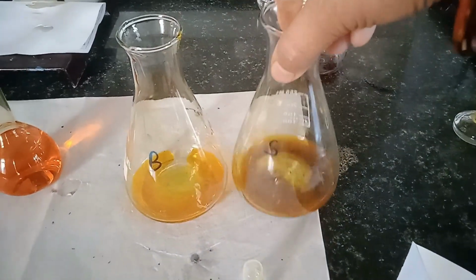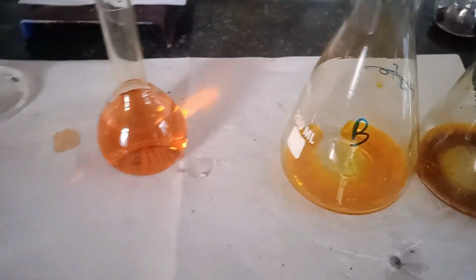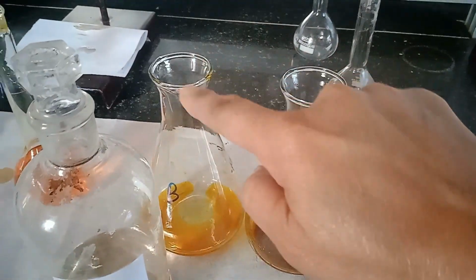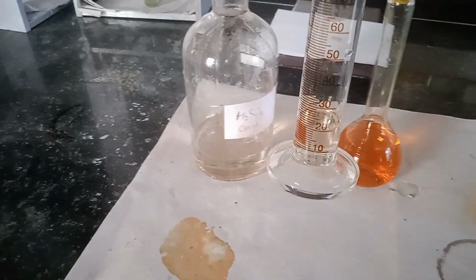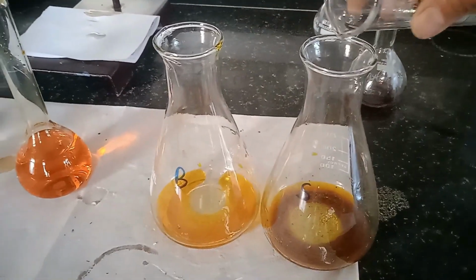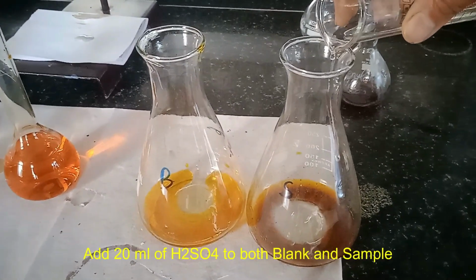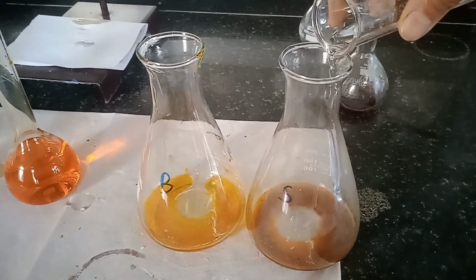In both conical flasks, I am going to add 20 ml of concentrated H2SO4. This is our concentrated H2SO4, and we are going to add 20 ml each in both the sample as well as the blank. So here I am going to add 20 ml of sulfuric acid to this sample in which we have our soil.